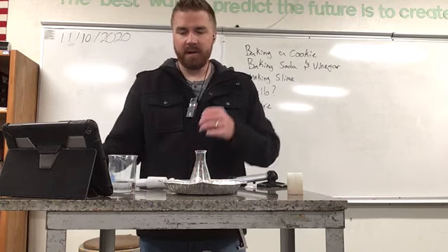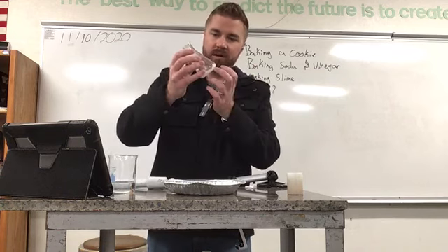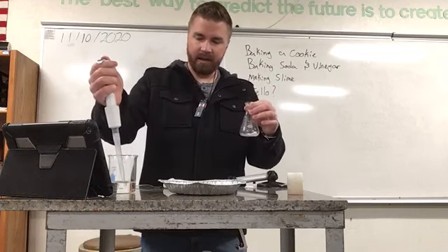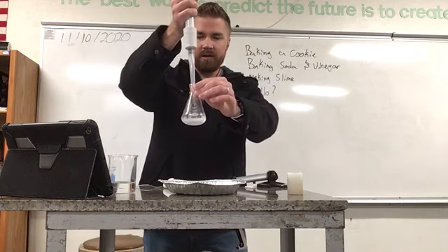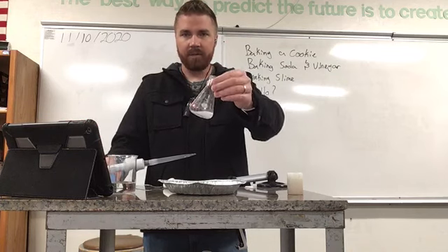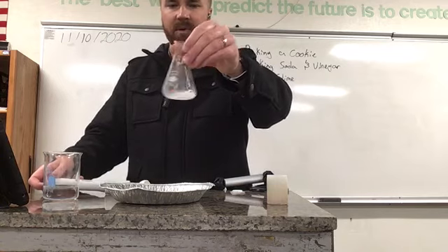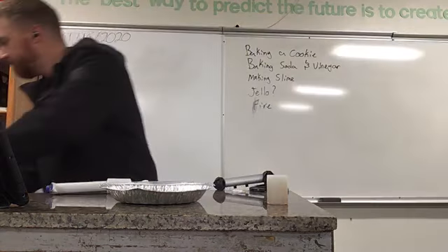Okay? So the first reaction I'm going to do today is that classic baking soda and vinegar. So here in a flask I have some baking soda. Okay, properties is that it's a white powder. Okay, it's non-flammable. Okay, things like that. Then I have 4 milliliters of vinegar. Vinegar is a liquid. Okay, together as they mix, as I'm sure you are familiar with, they produce gas bubbles as well. So they're producing brand new little gas bubbles there. Okay, very simple. So record those properties.